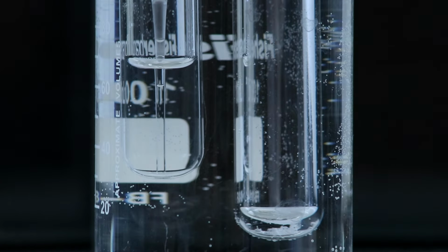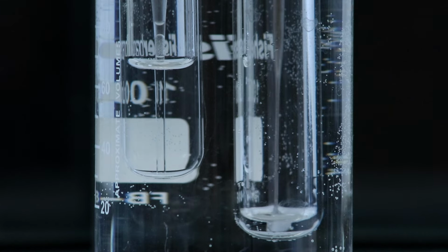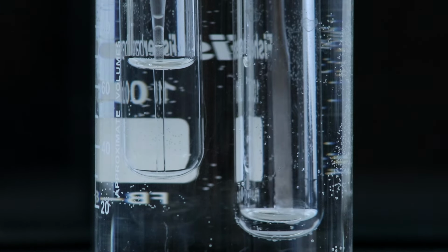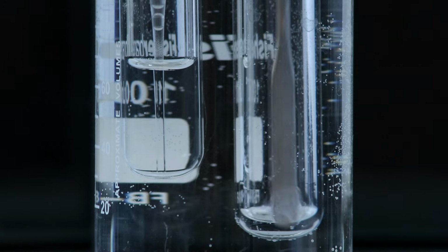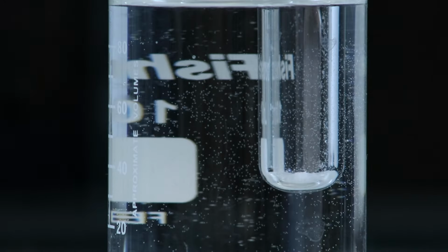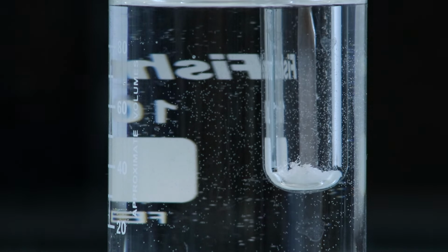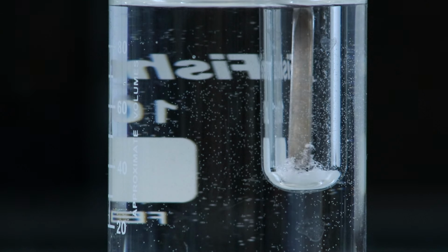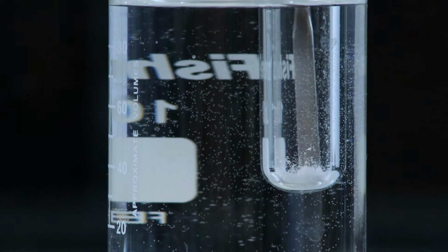When I put the first test tube in, the solid just melted, which is actually a pretty good indication that the alcohol I have is one of the four that has a melting point below 100 degrees Celsius. But from here, I will be careful to monitor the temperature of the water so that it doesn't get too hot. I'm going to keep the temperature around 50 degrees just in case I do have the one with the lowest melting point, and I'll place a thermometer in the water bath to make sure it stays around there.